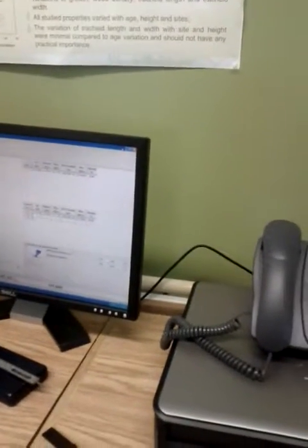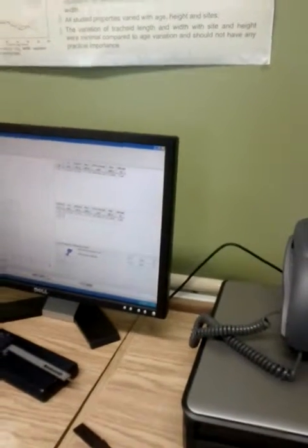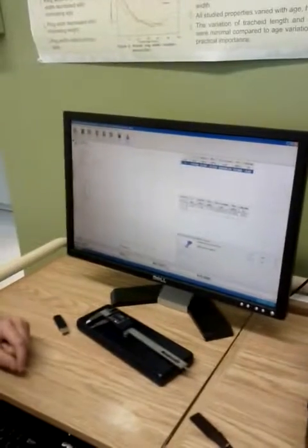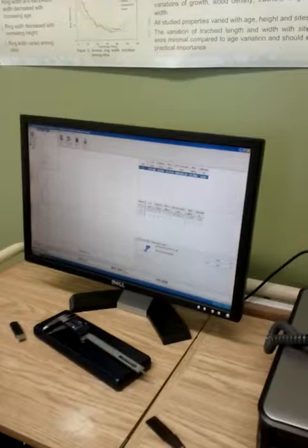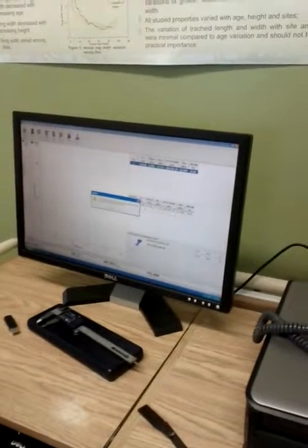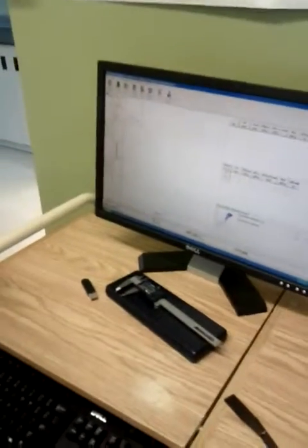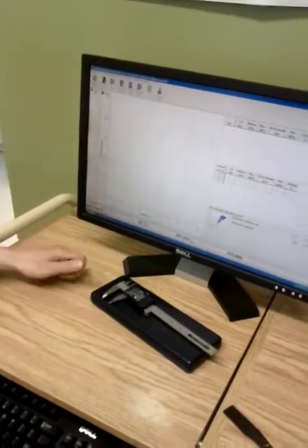When you begin again, you want to remove this curve. So you just select all, right click, or go to Specimen Management and delete. Say yes. Now it begins with 3. If you prefer to have 1, you can right click here on series and then renumber the specimen, and it goes back to 1. But if it begins with 3, that doesn't really matter.